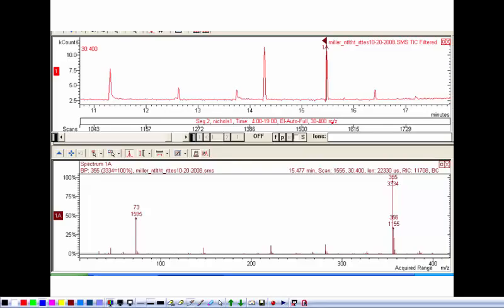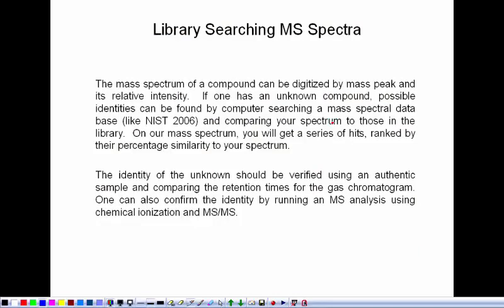Right. So where mass spectrometry is used in a structural sense is that it is possible to be given an unknown compound and try to figure out what it is just from the mass spec. As I said, that part of CSI is real.